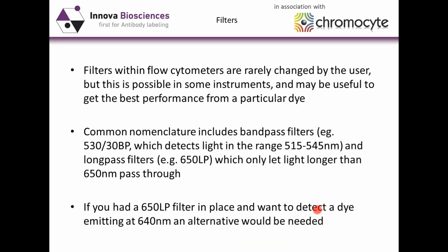Filters are also important, but I think it's still, even with modern machines, very true to say that filters within flow cytometers are rarely changed by the user. It's possible in some instruments, and it might be useful to get the best performance from a particular dye. In most cases, you'd want to take advice from the manufacturer of the flow cytometer, both about the actual technique of changing the filter and also of the best filter for the dye that you're using.